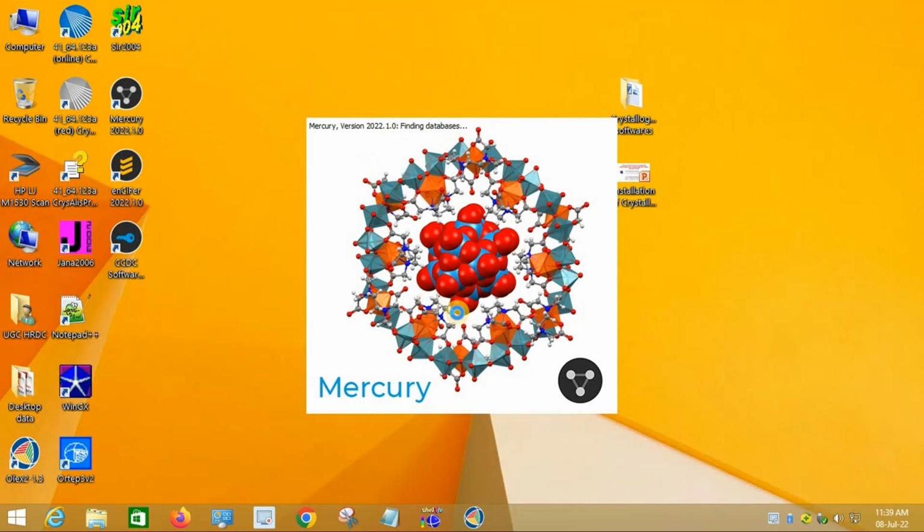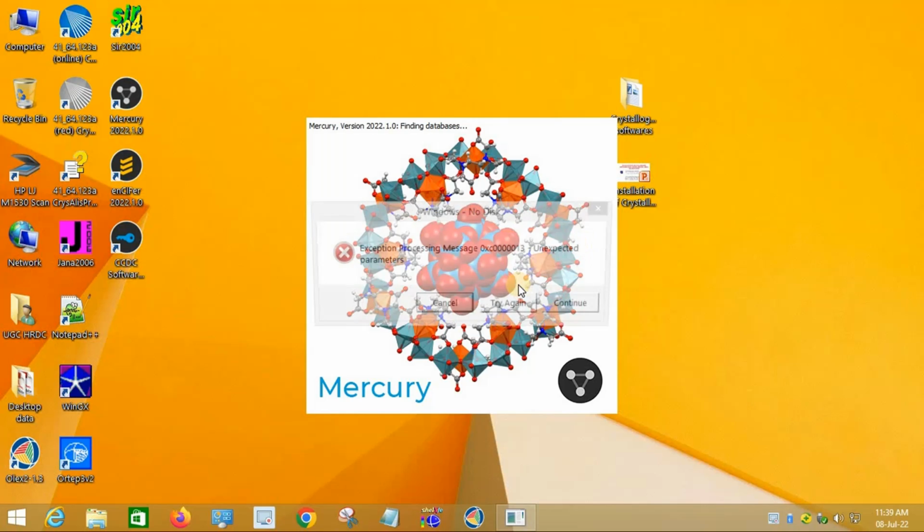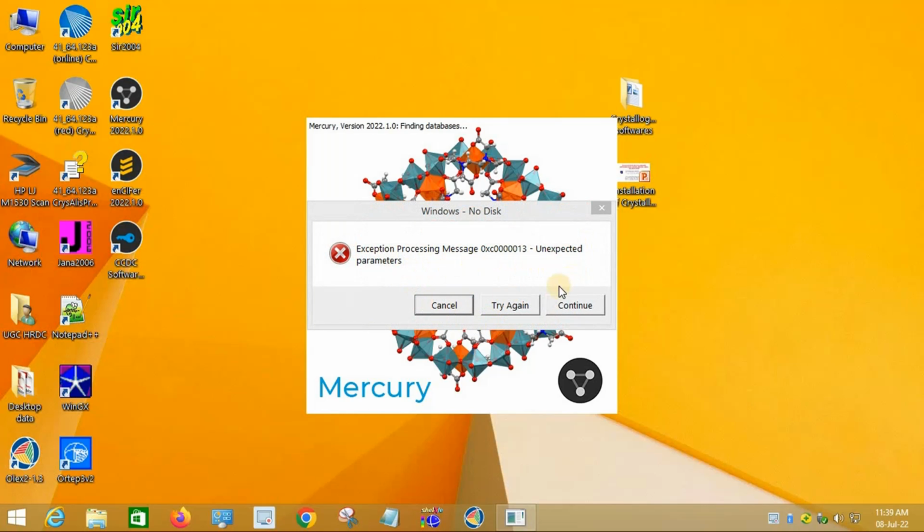Now a new window will appear. Exception, there are error messages. Okay, let's continue. Let's cancel it. Error. Okay, the error is still continuing. Okay, we will see it later.